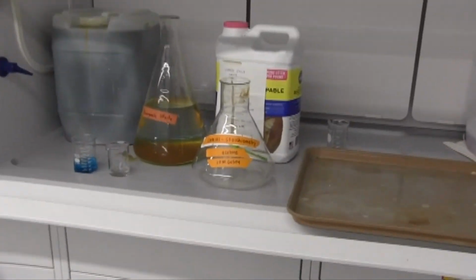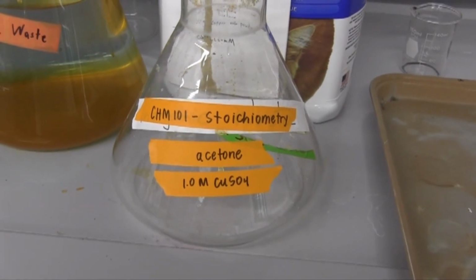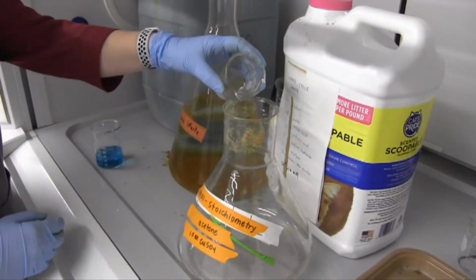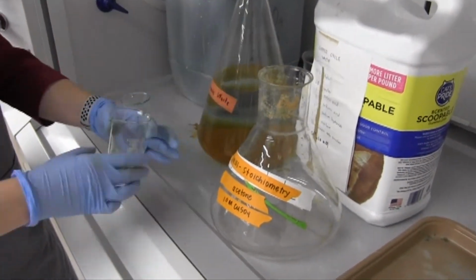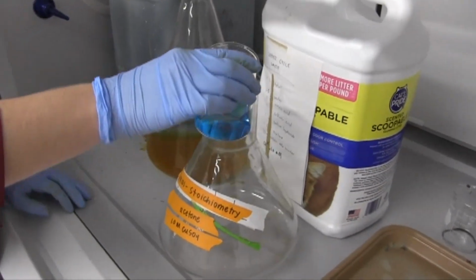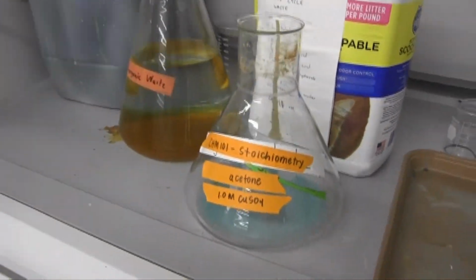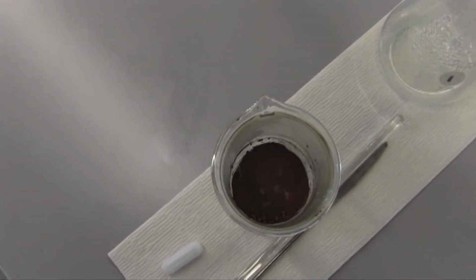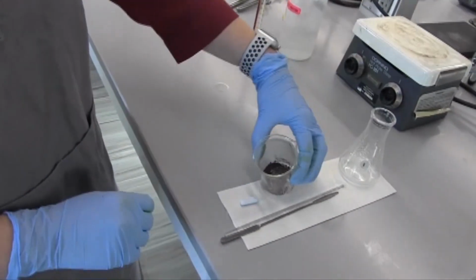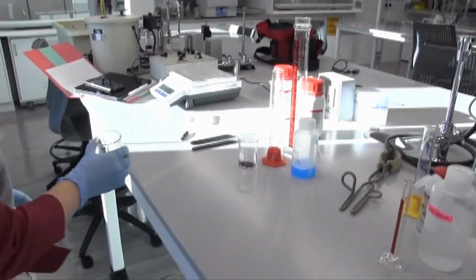While we're waiting for the product to cool, we can dispose of our waste in the proper waste receptacles. Make sure that you find the waste receptacle that is labeled with your lab and has a list of the products to be disposed of in it. Now that our product has cooled, we can take the mass of the solid copper.